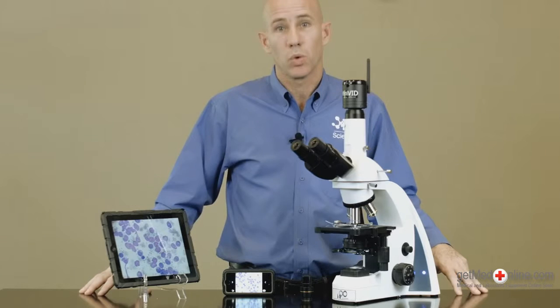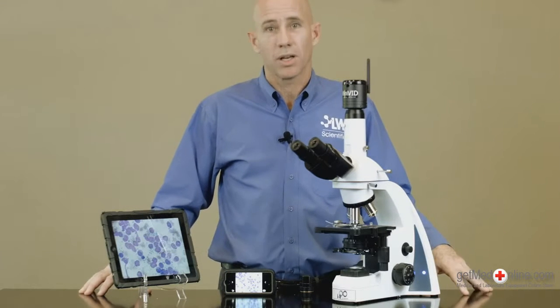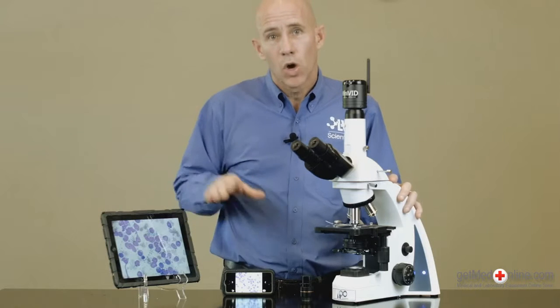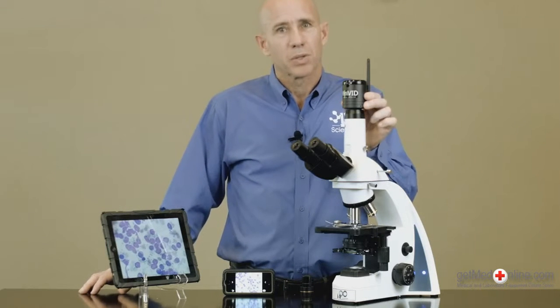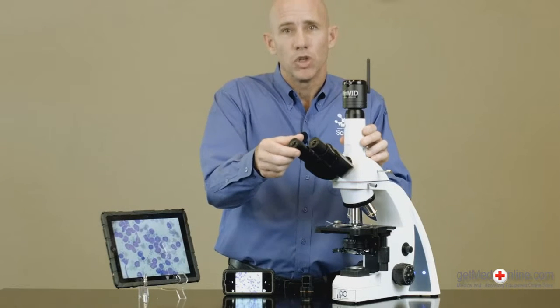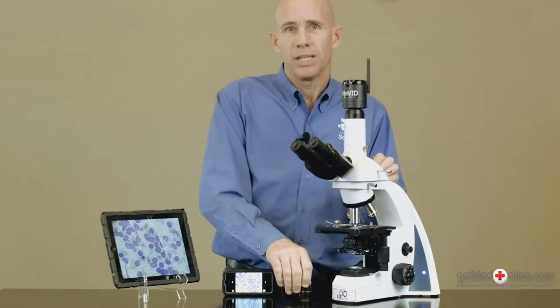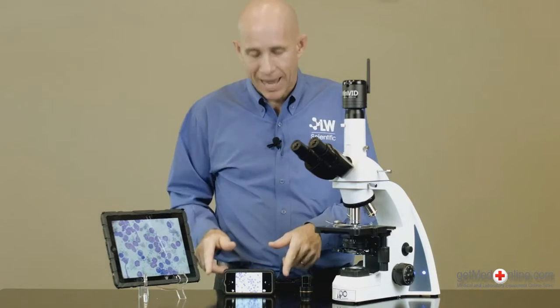Veterinarians and technicians will love showing ear cytology or fecal parasite images to clients using their smartphones or tablets. Mount this 5 megapixel camera onto any trinocular head or even into the eye tube of any microscope using the optional eye tube adapter for instant images on multiple devices at the same time.